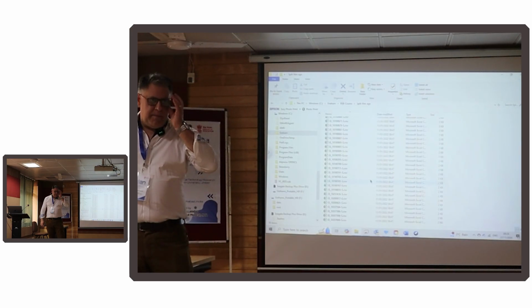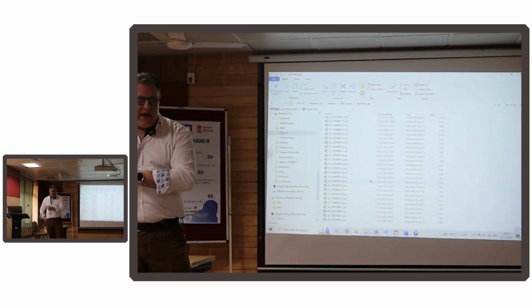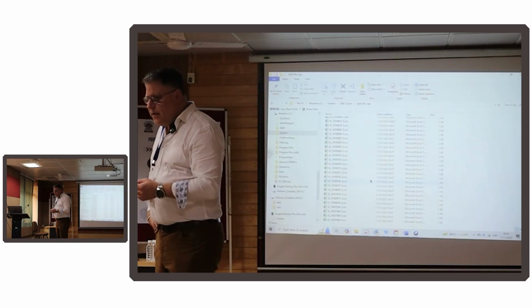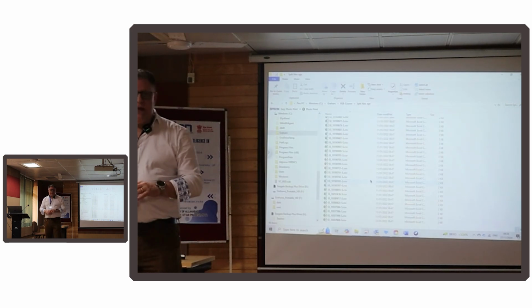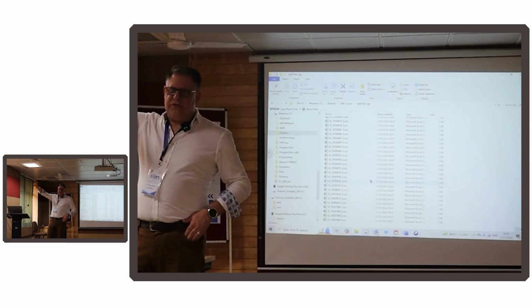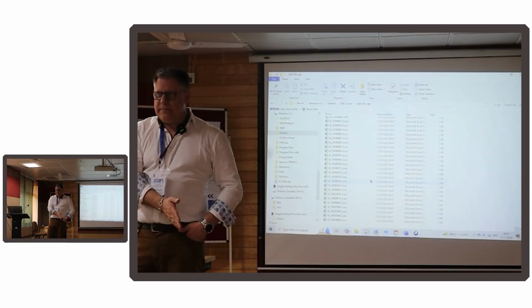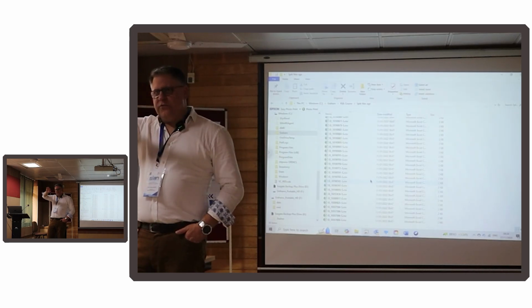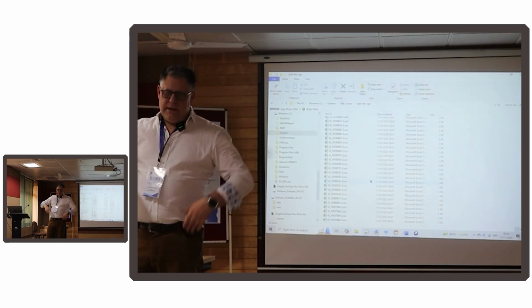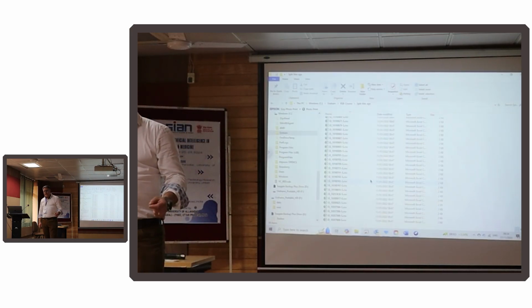We recently had a paper published on muscle aging, and this is data from that muscle aging study. But what I've done is, the data structure would normally be, we have the genes across the top and the cases down the side. And we might have 20,000 genes along the top and 100 cases, 200 cases down the side.